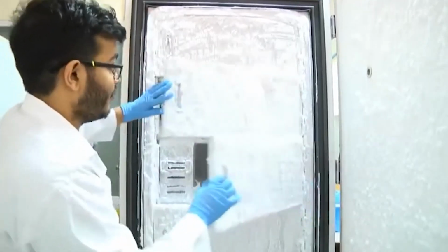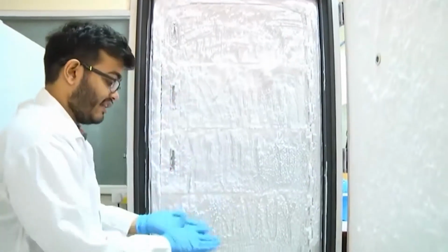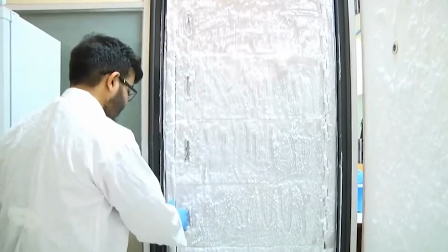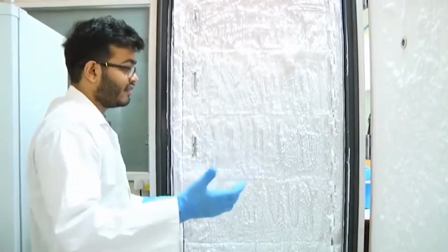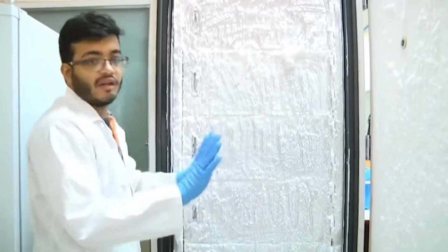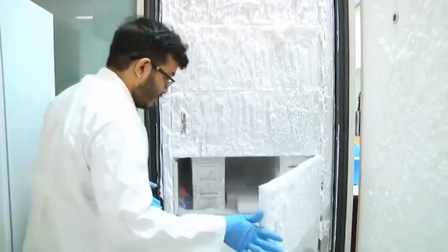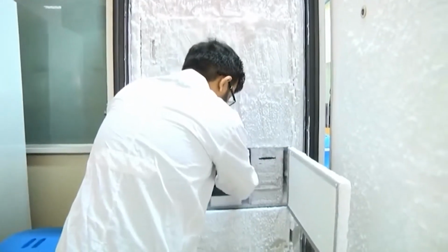So, be very careful. I am wearing normal gloves, but ideally you should wear cryoprotective gloves while working with minus 80 degree centigrade. But if you are experienced like me and a quick worker, normal gloves are fine.